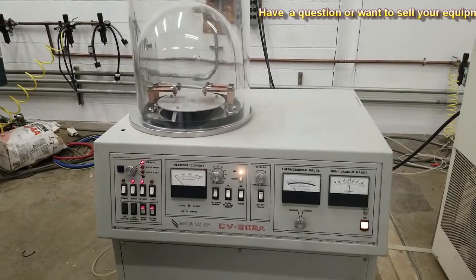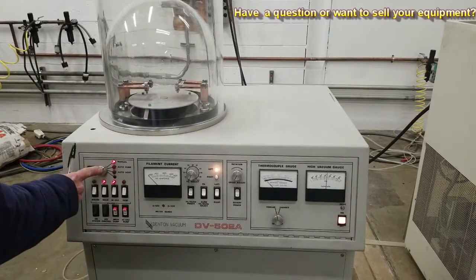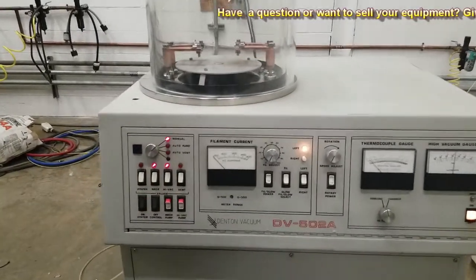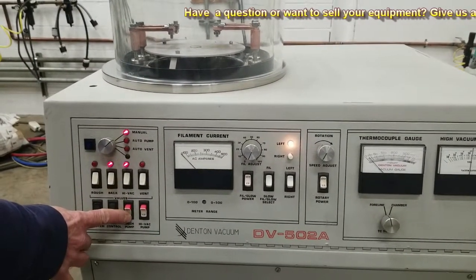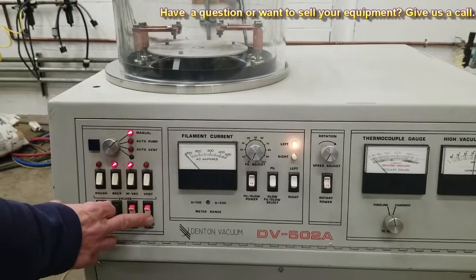Right now I'm manually pumping it out. This turns on your mechanical pump — I'll show you that, it's in the back — and this turns on your diffusion pump.